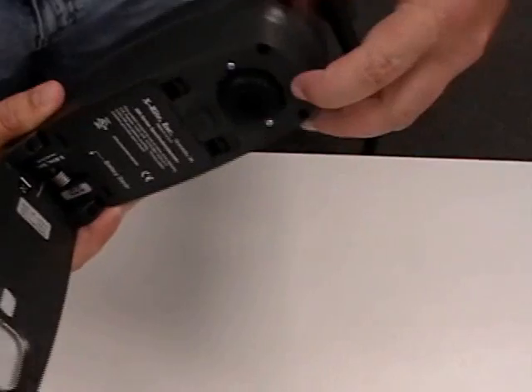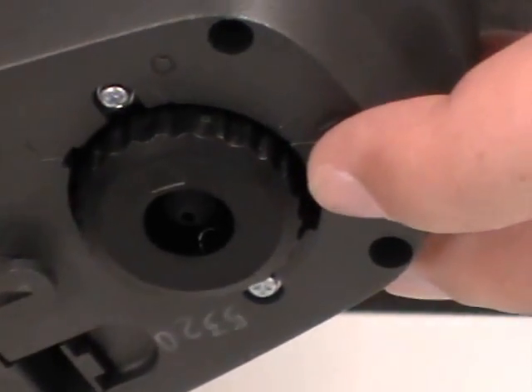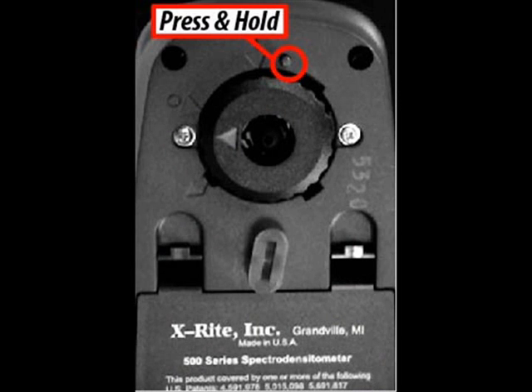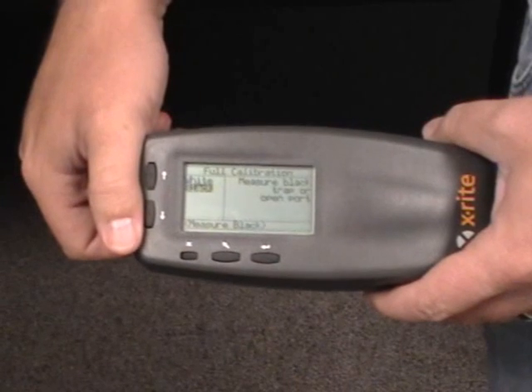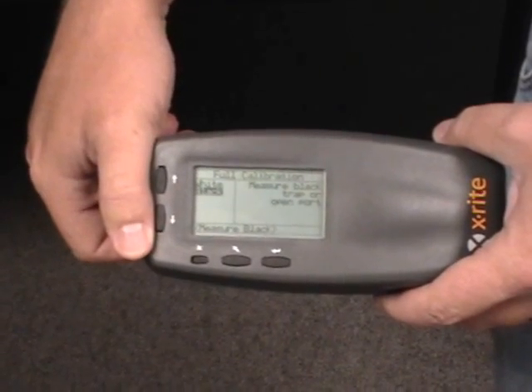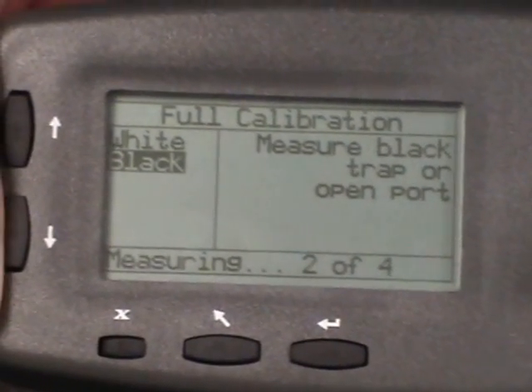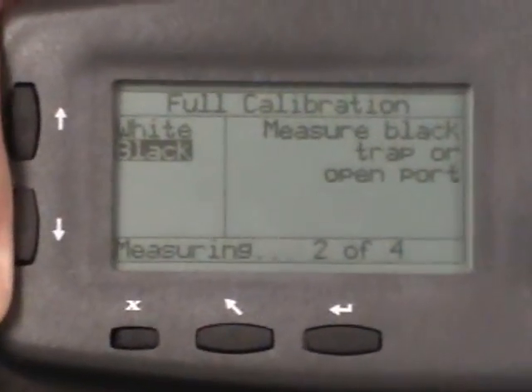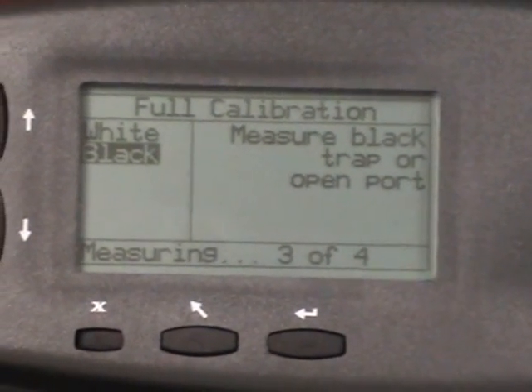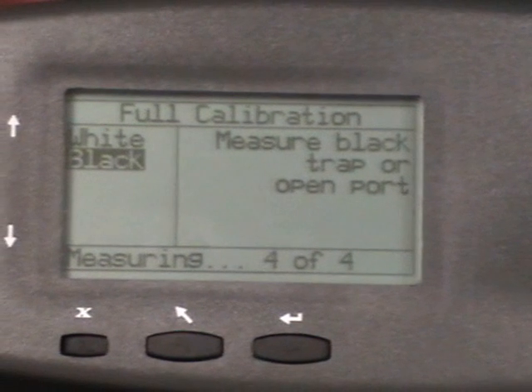Near the actual measurement port, there's a small little pin sticking out. By pressing it, it is going to cause a measurement. What we suggest is in a dimly lit room or underneath the desk, you press the pin causing it to take the measurements. It's going to take four measurements — you can see what number you're on in the bottom corner. After four measurements are complete, that will finish the black cal and the full cal will be complete.